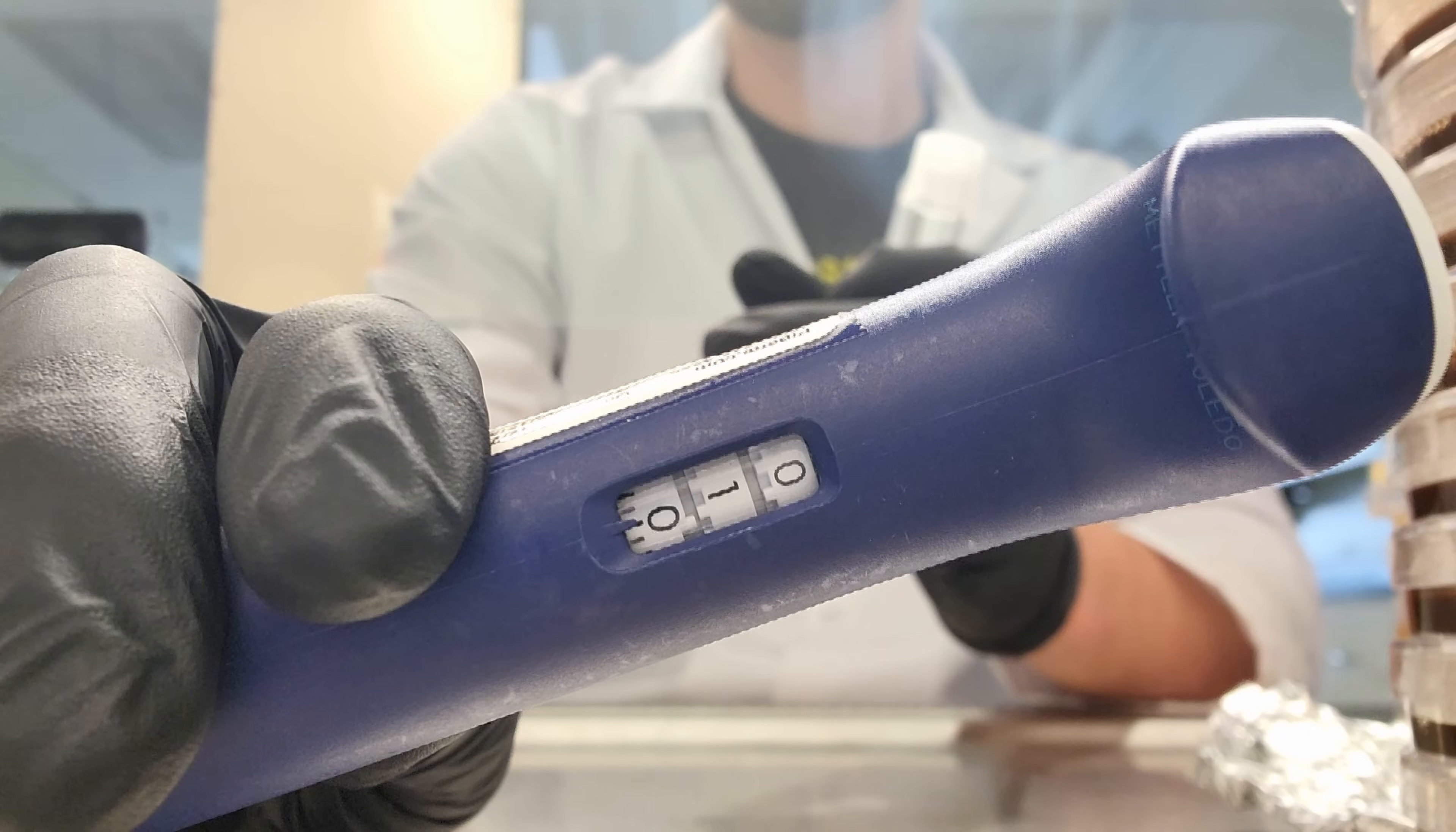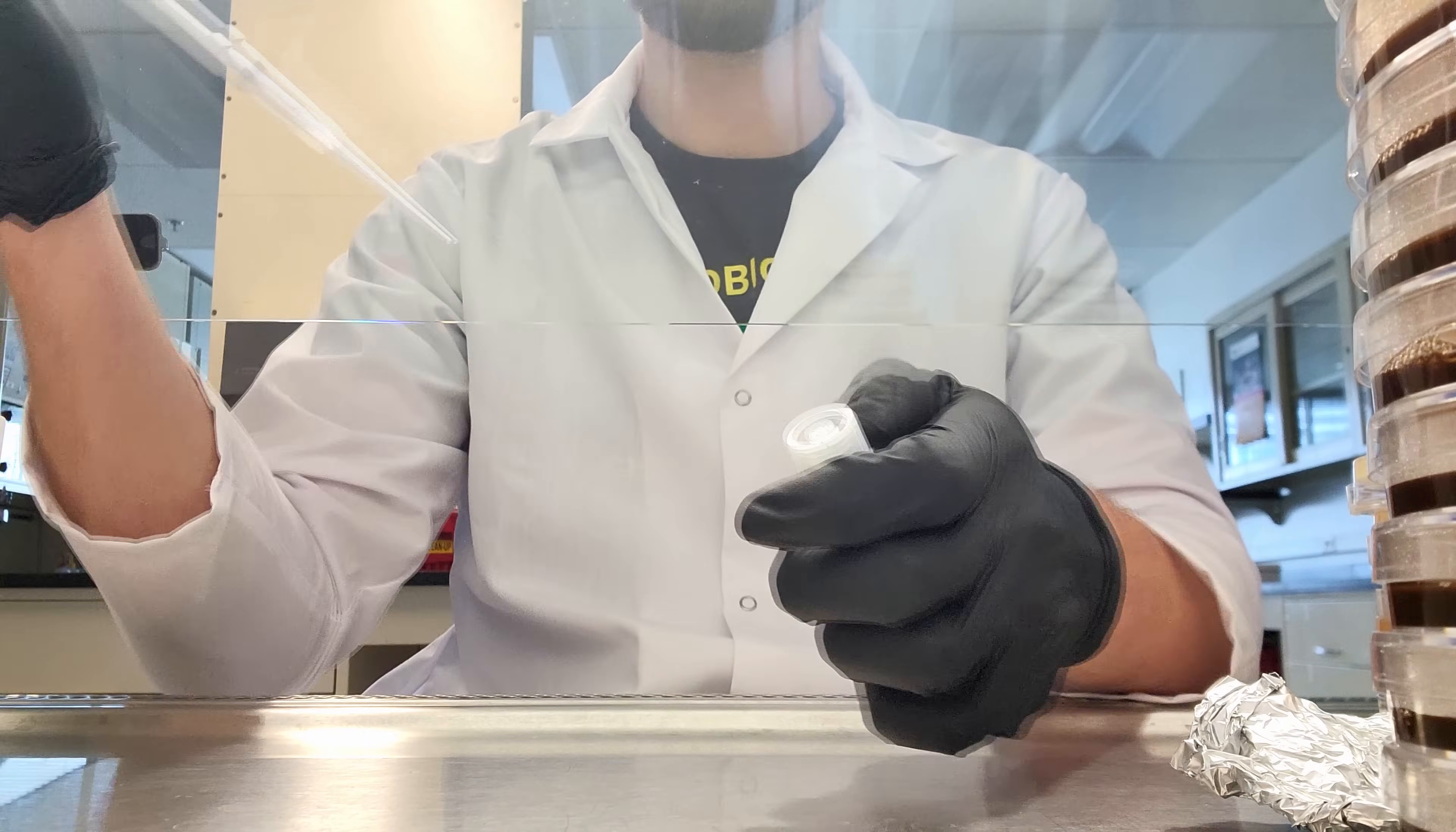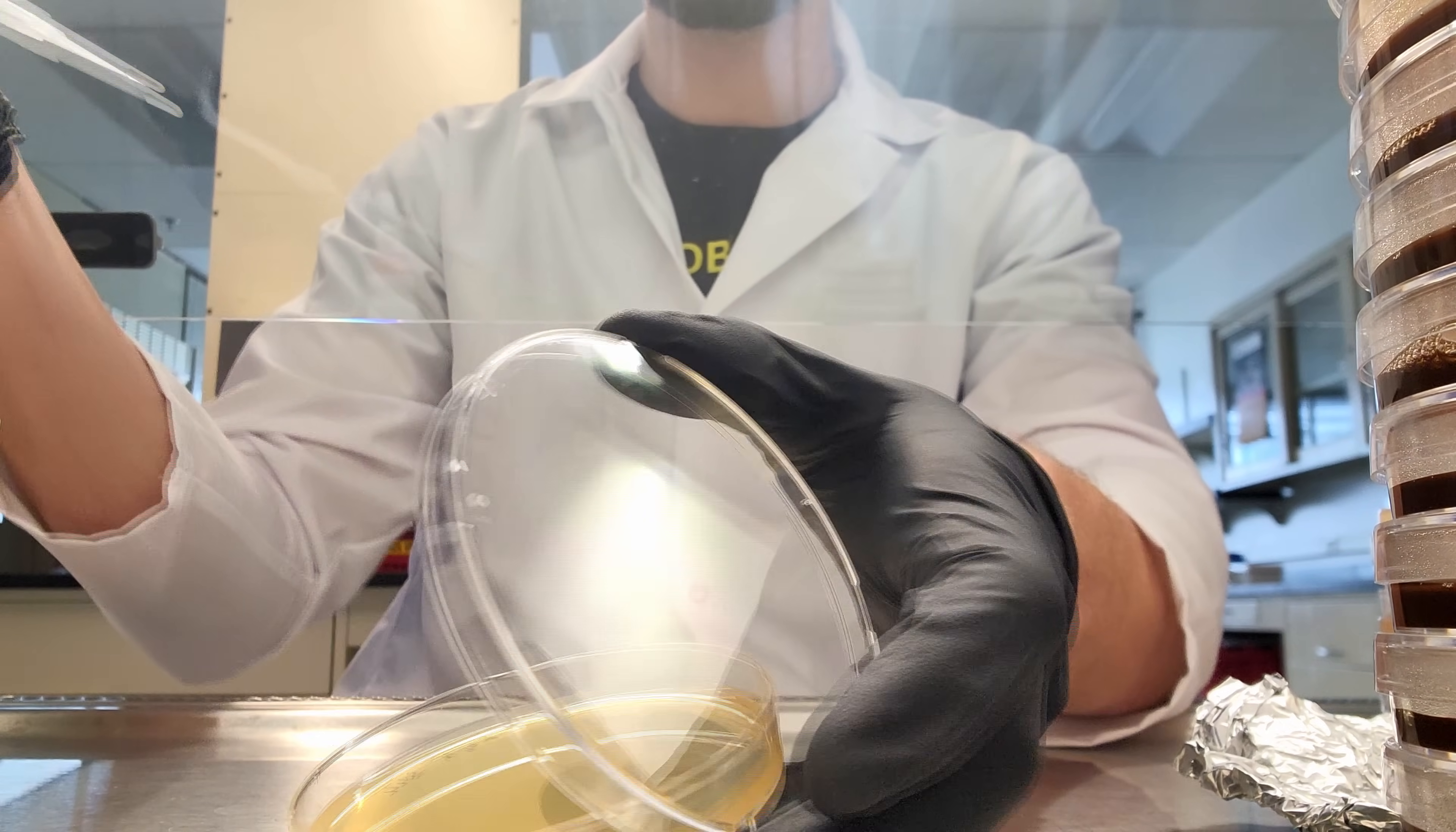It's important when you're resurrecting these cells that you make streak plates, isolate an individual colony, and then regrow that individual colony to make your new glycerol stock or lyophilized freeze stock. That's to make sure your genetic background is consistent. I'm taking 10 microliters of the culture just to be certain we're getting some cells and putting it directly on the petri dish.